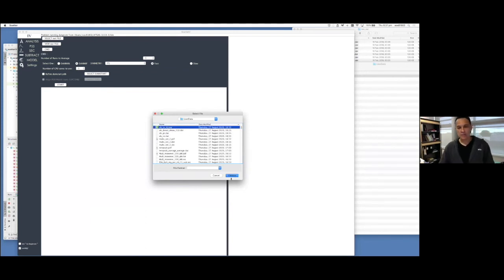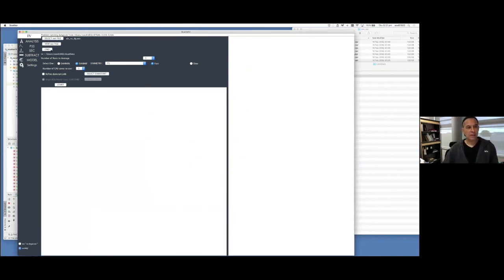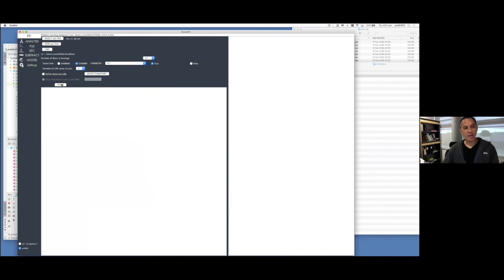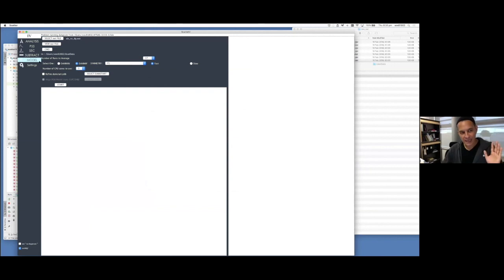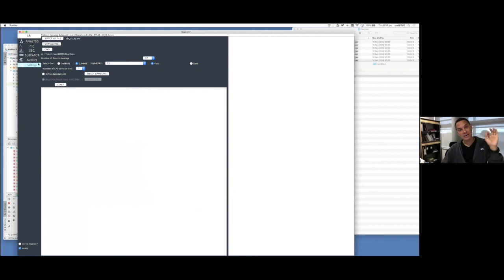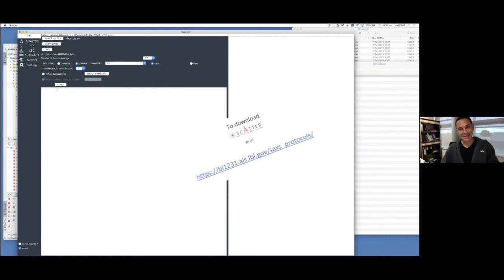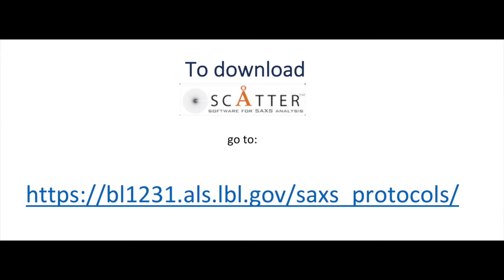When you run the Refine button in Scatter it will automatically run the auto GNOM. Just make sure Settings is configured correctly, hit that button, and once done you can select the GNOM file over here and run DAMMIF — 17 runs, P1 symmetry, fast mode, 3 or 4 cores — hit Start and it'll run DAMMIF 17 times and produce an averaged model at the end. Just make sure you've told Scatter where the binaries are and you're not using the latest ATSAS.